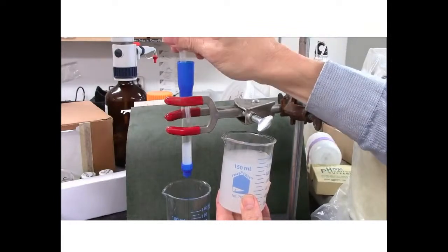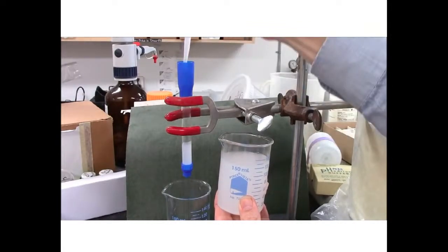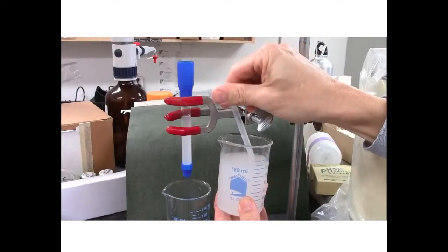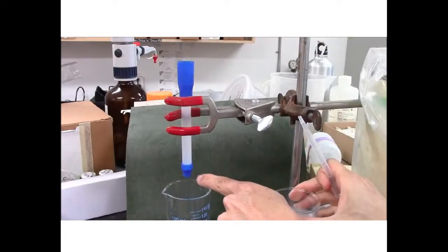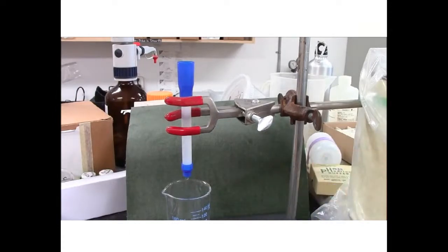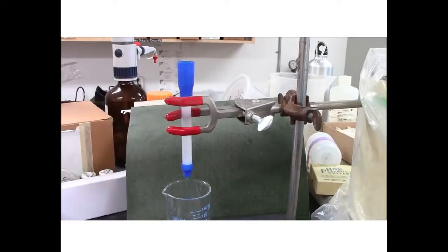For gel filtration, I want a fairly tall gel bed, so I'm trying to mostly fill this column. Excess buffer will drip out the bottom. Here you can see the drips coming out the bottom. The gel bed is starting to settle a little bit.